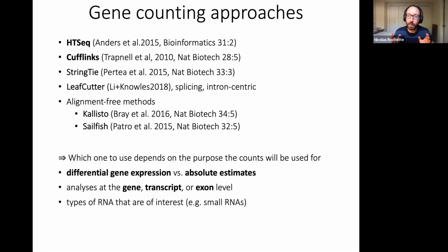And what this means is that when we're comparing two samples, so when we have a differential approach, we can just assume that all the biases in the samples from one group and all the biases in the samples from the other group, so all the systematic biases from the mapping, from the library preparation, and from the counting, are going to be similar. So for instance, some genes may just be enriched during the library preparation process, for instance because of differences in GC content.